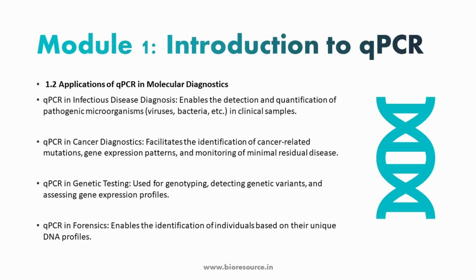Coming to the various applications of qPCR in molecular diagnostics, we can see that qPCR is widely used in detection of infectious diseases. During the COVID, this has taken off to an exponential level. The applications of qPCR have been widely utilized for monitoring and detection of virus and pathogens. The advantage is that qPCR can give quantitative information about the pathogen that is present in the sample, whether it is a virus or a bacteria, and any form of pathogen that is present can be quantitated. That means the amount of the bacteria or virus present in the sample during an infection can be identified.